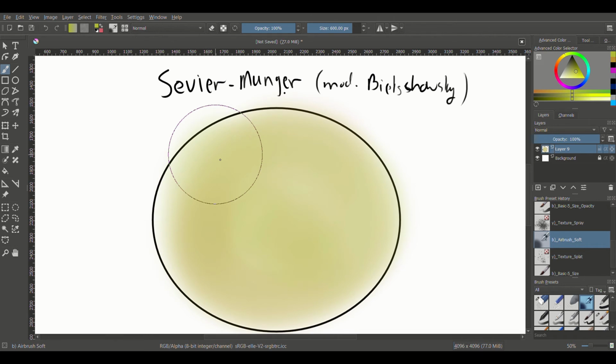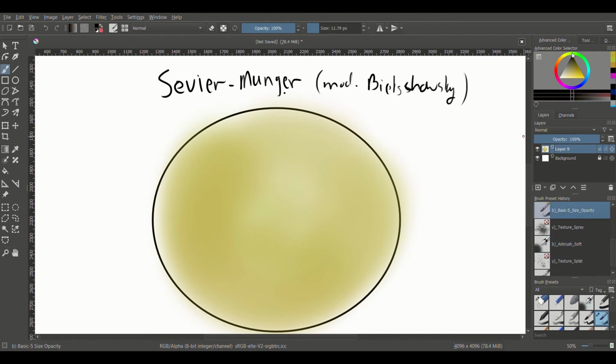And it's going to vary in terms of how close to orange it gets. But essentially you're going to have that, with your neurofibers and the tangles showing up. And essentially you're just going to use sodium thiosulfate like you normally would to get rid of any excess, but you're going to keep this background here.